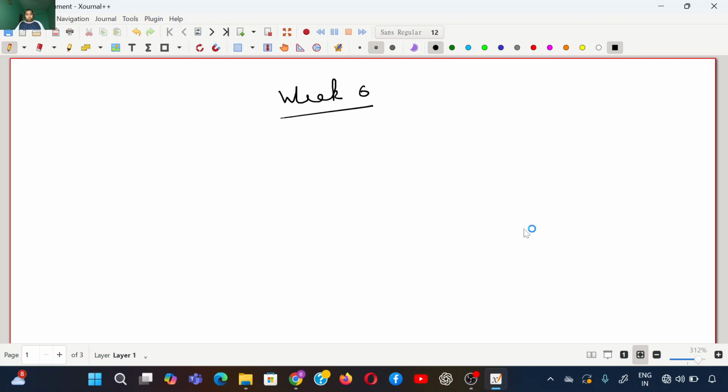Yeah, hello, welcome to week six. So in this lecture, we will be focusing on flame atomic absorption spectroscopy, which is the most common and straightforward type of AAS, where a flame is used to atomize a sample. It has wide applications in environmental, biological, and industrial analysis for detecting metals at the ppm as well as ppb level.